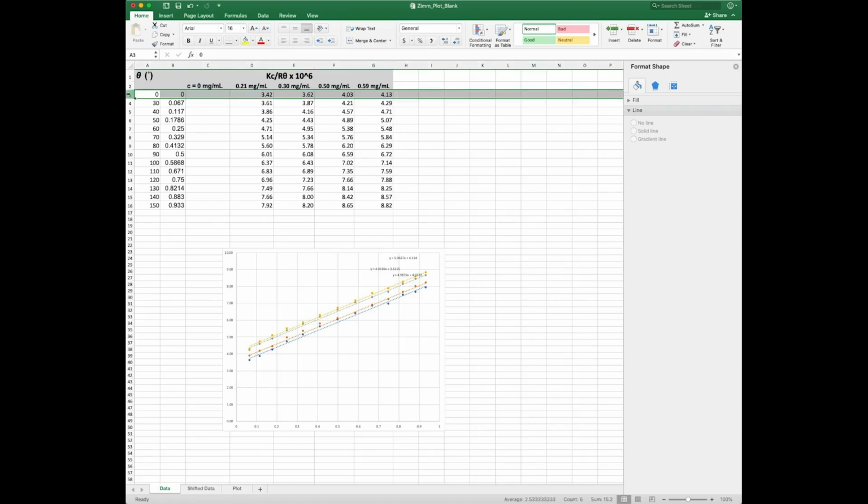So now we have that data. What we've got here is basically light scattering as a function of concentration, and there's going to be no Q dependence there. So what does that mean in terms of our Zimm equation? Well, if there's no Q dependence, then if we can get the data for zero concentration, we should be able to get information about the molar mass. Look how we can do that.